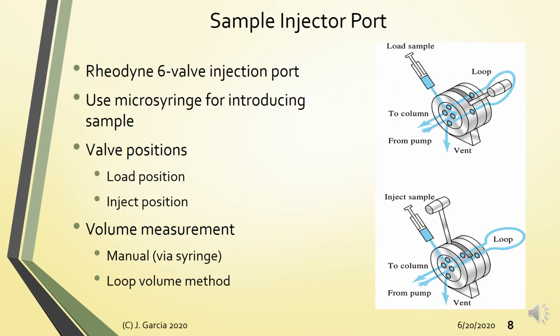So next, you have your sample injector port. This is something I left out from your handout, no? So please take note of this. A common design for the sample injection port is the so-called Rheodyne 6-valve port design. Alright, so it looks something like this.